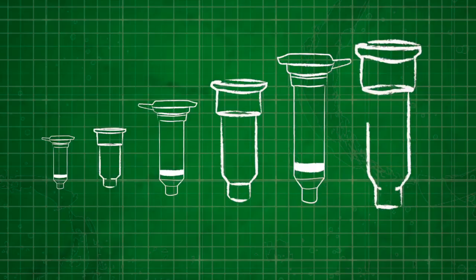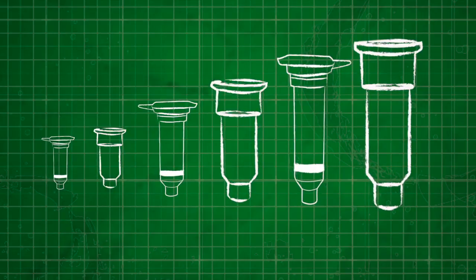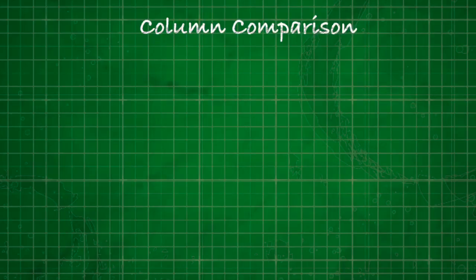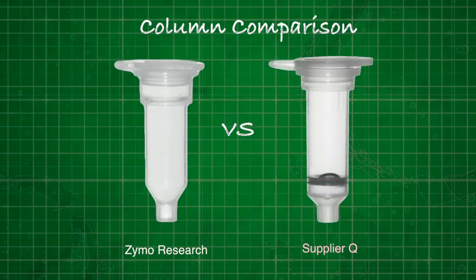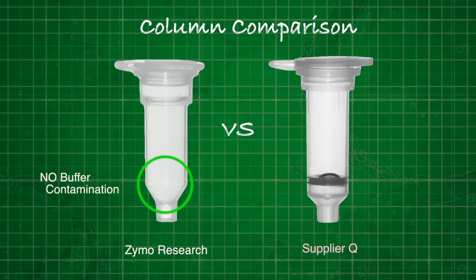Columns come in different shapes and sizes, but not all of them work as well as others. Here's a classic example. Take a look at the column on the left. Now the one on the right, back to the one on the left. See a difference?